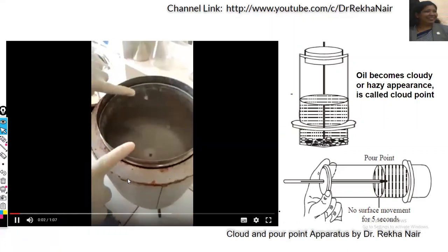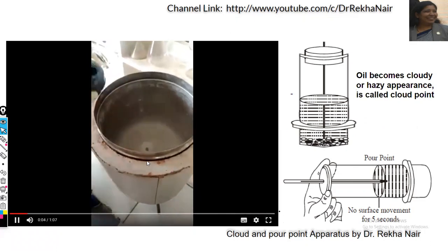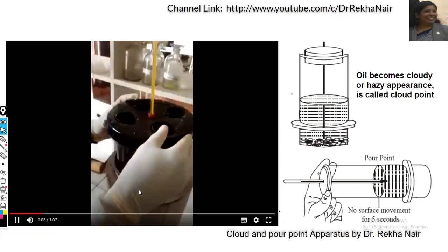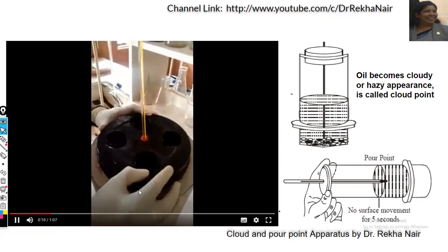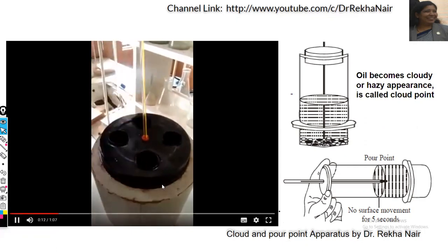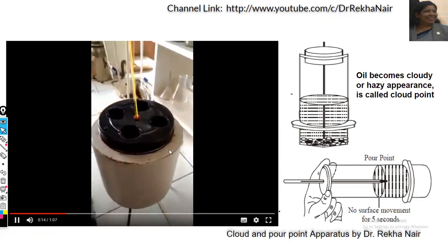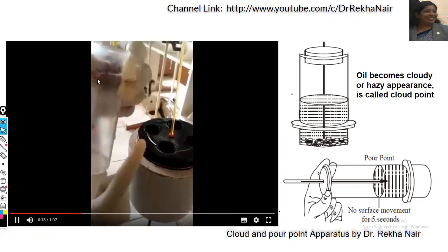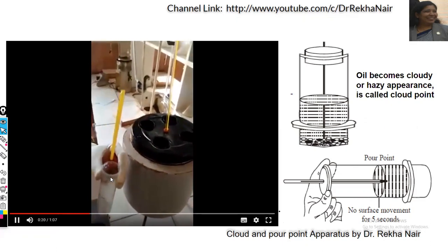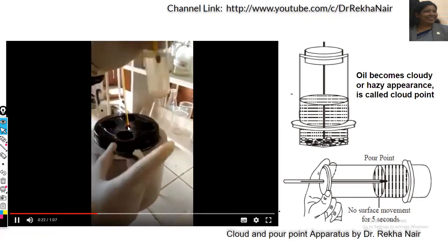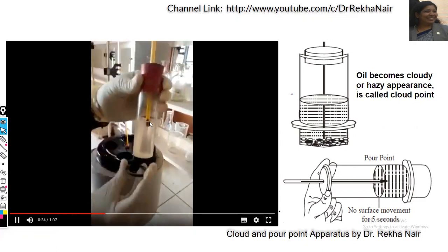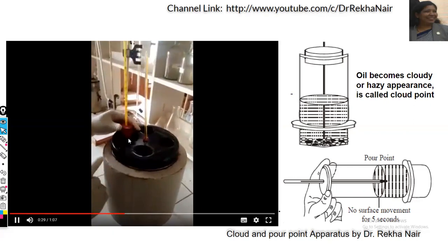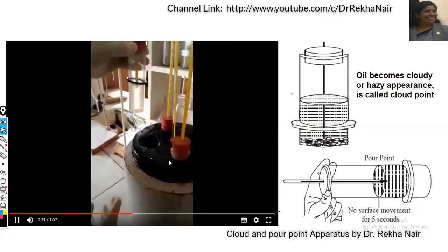This is the cloud and pour point apparatus. Here we put the water. Calcium chloride and ice mixture will be put inside the water so as to lower the temperature. This is a flat bottom test tube. The oil will be filled up to the mark and kept for cooling.